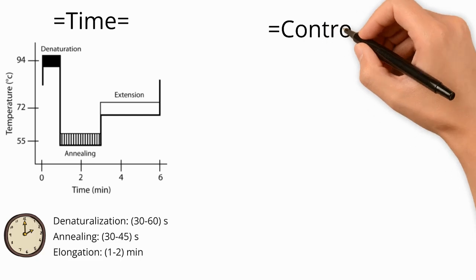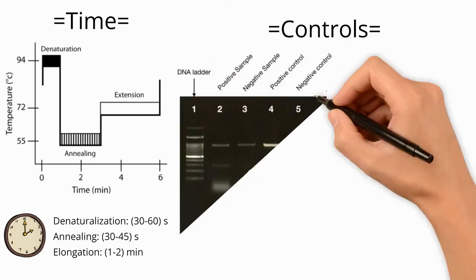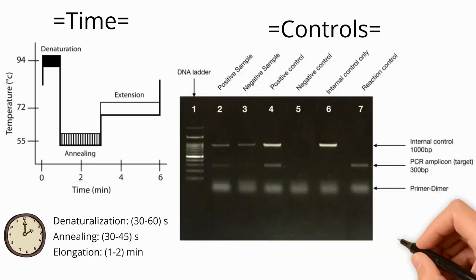A negative control is a PCR reaction with no amplification. It means no amplicon will be generated and is interpreted as a true negative. This kind of reaction checks whether there is any contamination within the reaction mix and checks if there is primer dimer forming. A positive control is often used to verify that all the reagents are working, primer annealing temperatures are correct, extension times are sufficient, and there are no PCR inhibitors within the experiments.